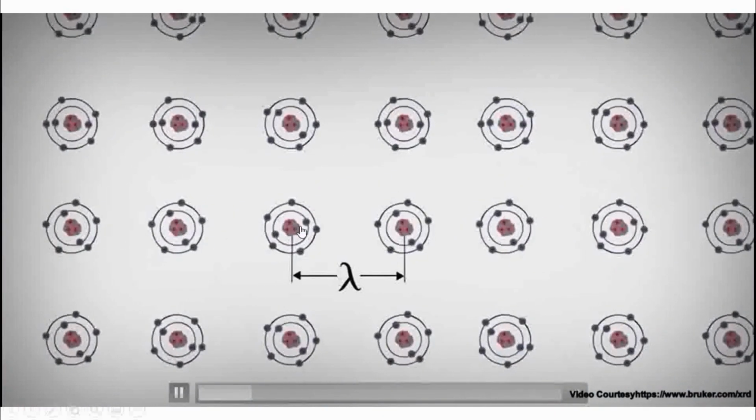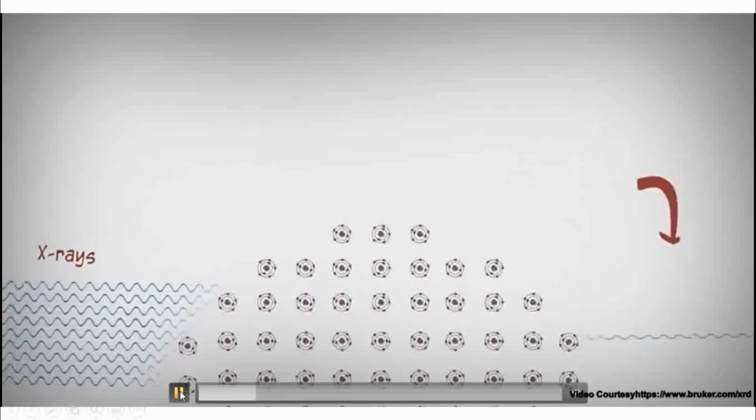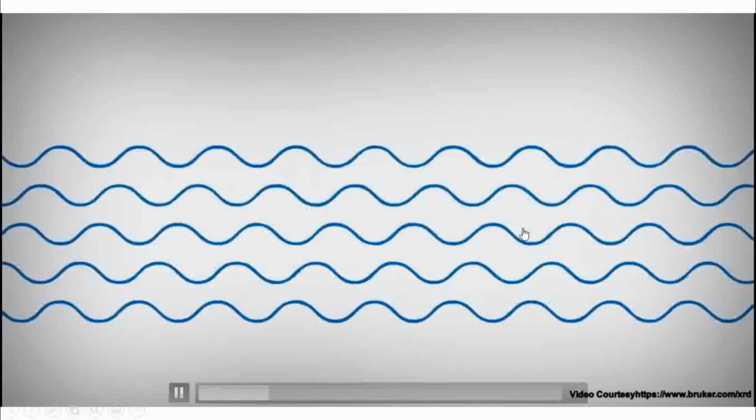And when the lambda passes, again coming to this point, why is X-ray used? Because the distance between these two atoms, or the distance d, is equal to the lambda, which is equivalent to the X-rays. So the distance or the wavelength and the distance between two atoms are more or less the same, and that is why X-ray is able to go inside and give you this information. So as the X-ray beams are changing, you see the diffractions are happening, right?